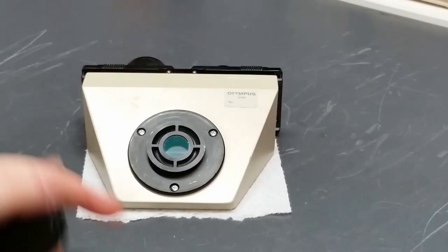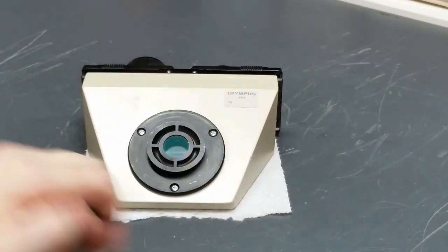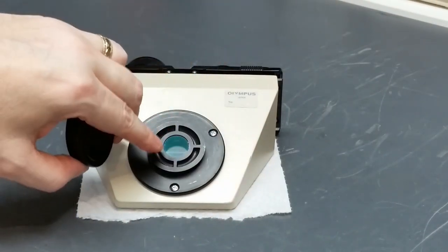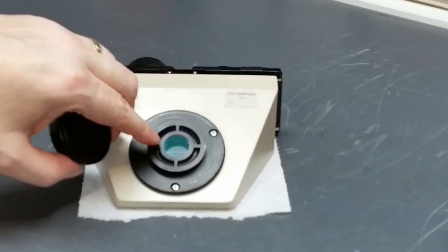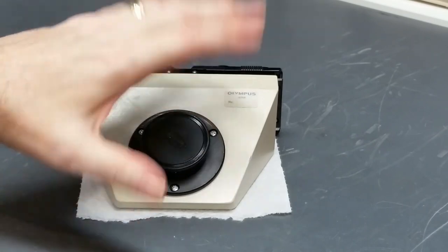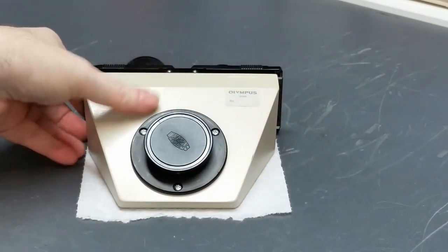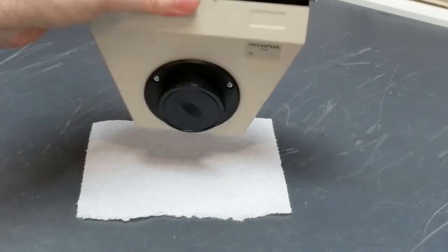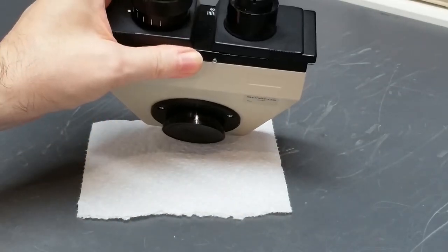Before I do just about anything else to this head, I've got a little plastic dust cap that I want to put over this bottom mount. There's a lens — or rather an optic, a cylindrical prism as they call it — right here. I want to cover that up just so I don't damage it or get it dirty. If you don't have a cap, just be really careful and make sure you don't cause any damage to that optic.